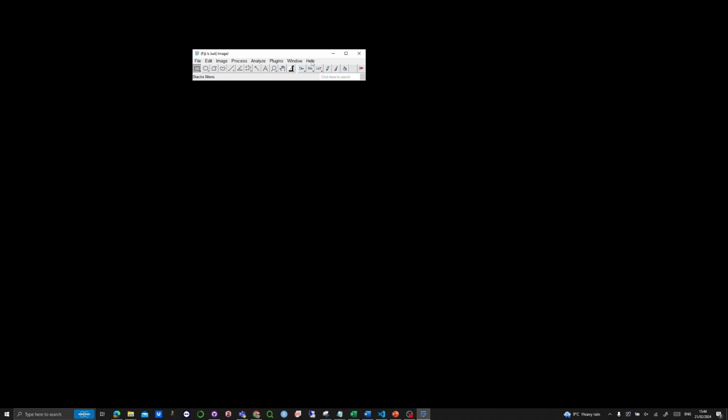Hello. So in this video, I'm going to introduce a recent tool which I developed, which is a virtual orientation tool, VOTj for Fiji. So this tool can be used for object centering, alignment, etc. So first let's get into how to install it.